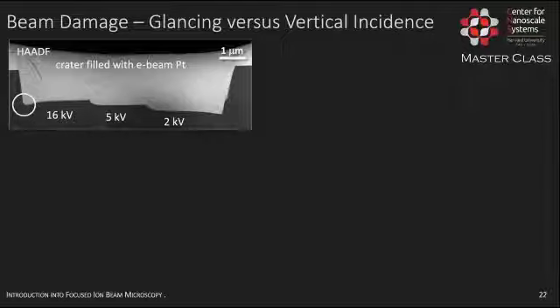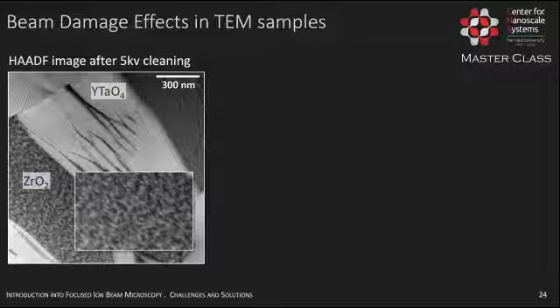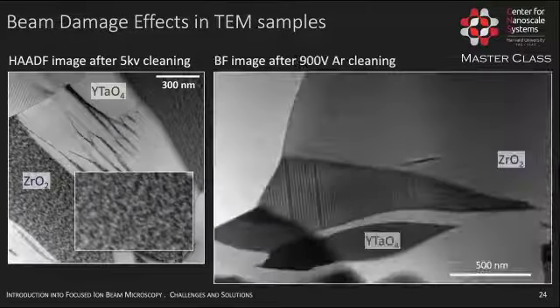You see, for example, the yttrium tantalate phase has these white stripes. So this is a real internal structure. These are twins that occurred during the mechanical deformation. And then if you look at the zirconium oxide, you see a very rough mottled structure. Much of that structure is in fact due to clustering of defects in the surface area of the zirconium oxide. The picture changes completely if we carefully clean the sample.